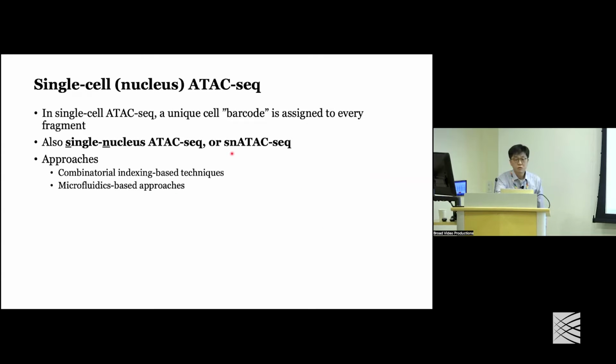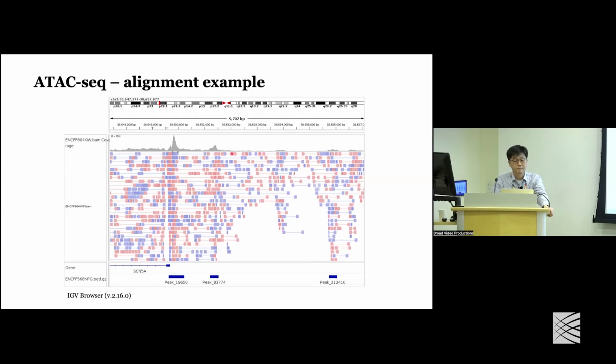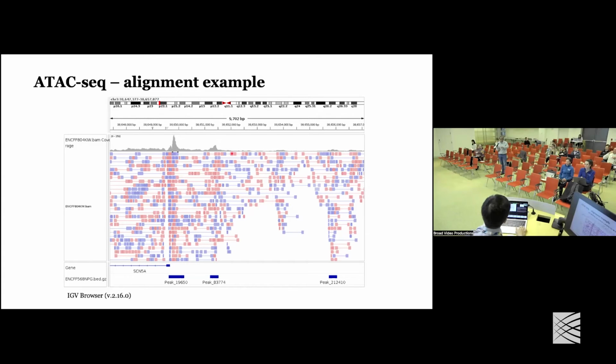So far I have described... yes, please. How should we understand the breadth of the peak, the border of the peak? What's the significance of that when I'm looking at these things? I understand there's a bimodal pattern with different reads attaching, but many times I have seen the length change. What is that telling us, and how do we understand what's biologically happening, or whether it's an artifact of something? How do we distinguish that?